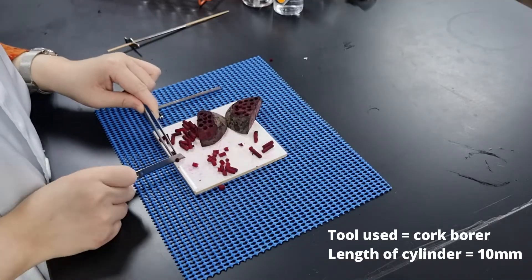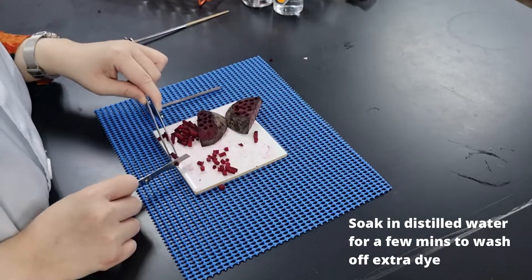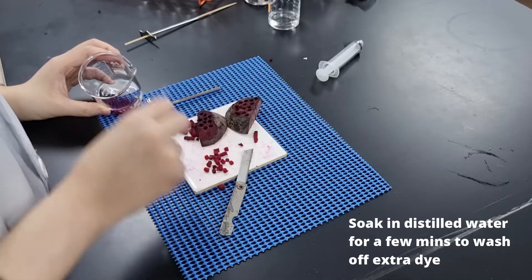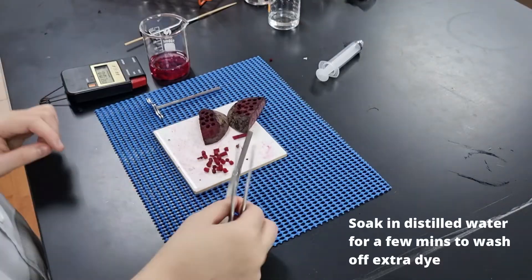After that, we actually take these 25 pieces of beetroot and soak them in distilled water for a few minutes just to wash off the extra dye that was produced due to the cutting process.